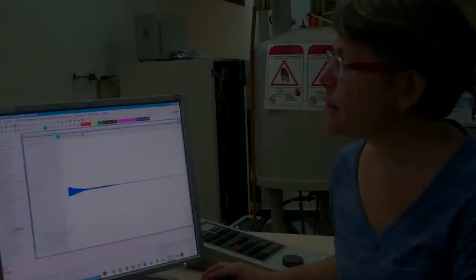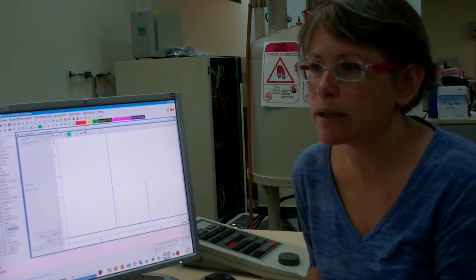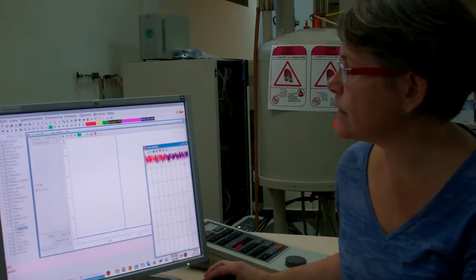And we see, toggle with this button here, a new spectrum. This is in real time. No data is being stored. Let's look at the lock display window at the same time. That's this orange button right here. I can resize it and move it to the side.